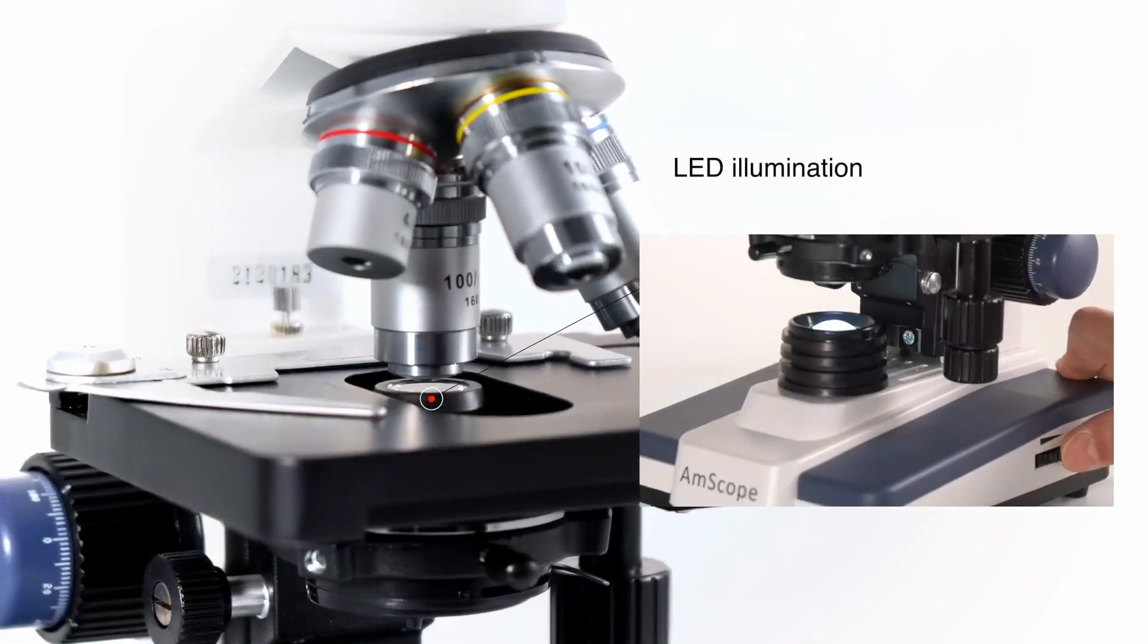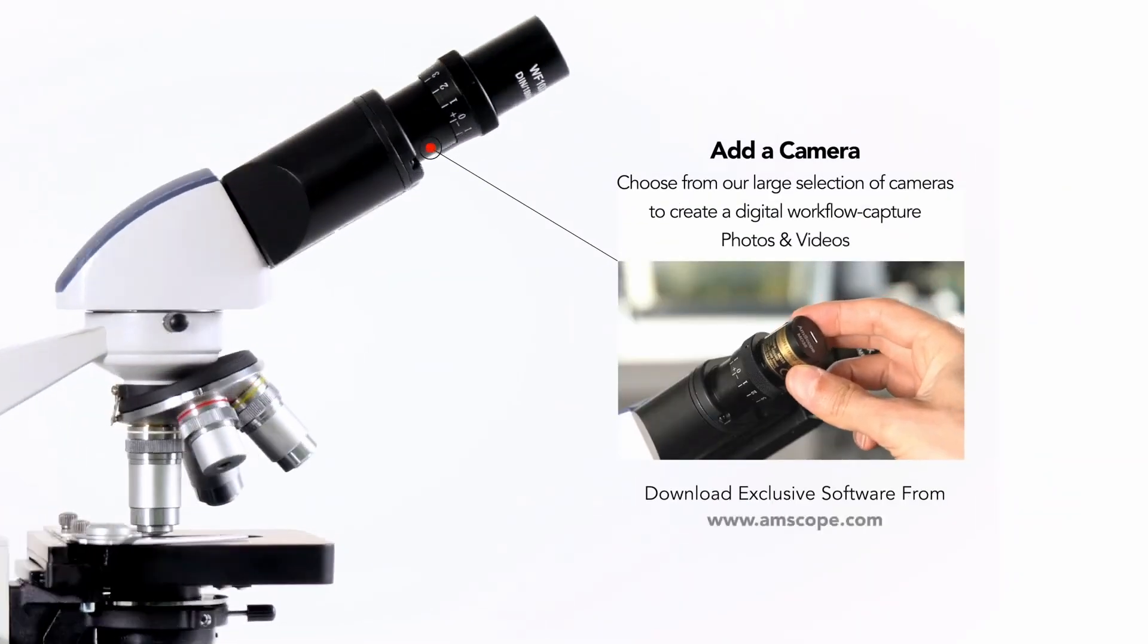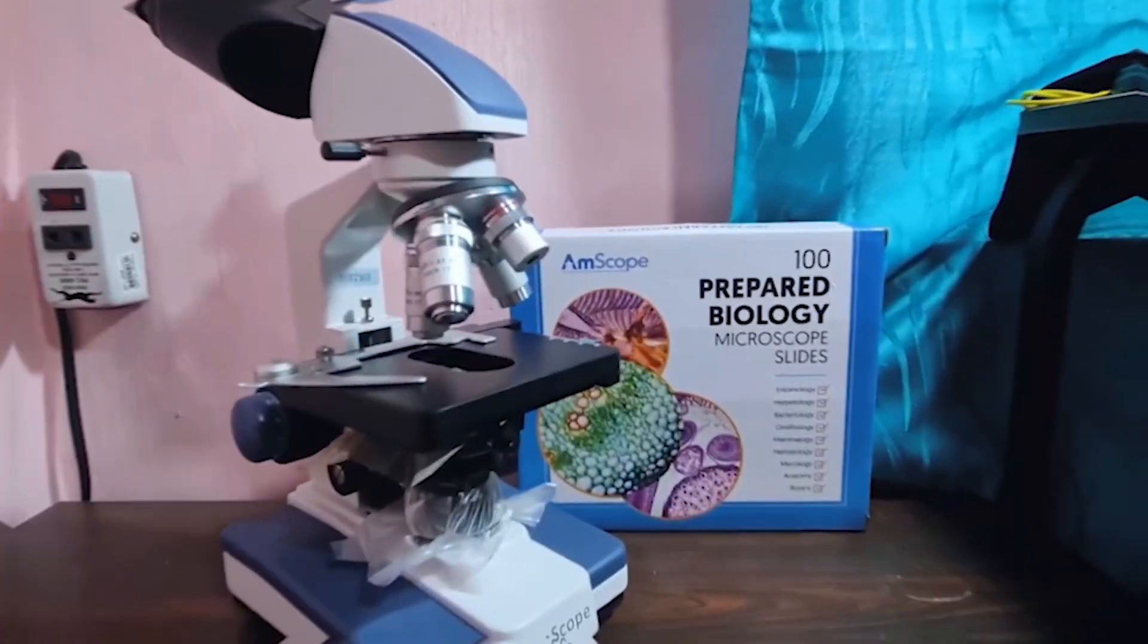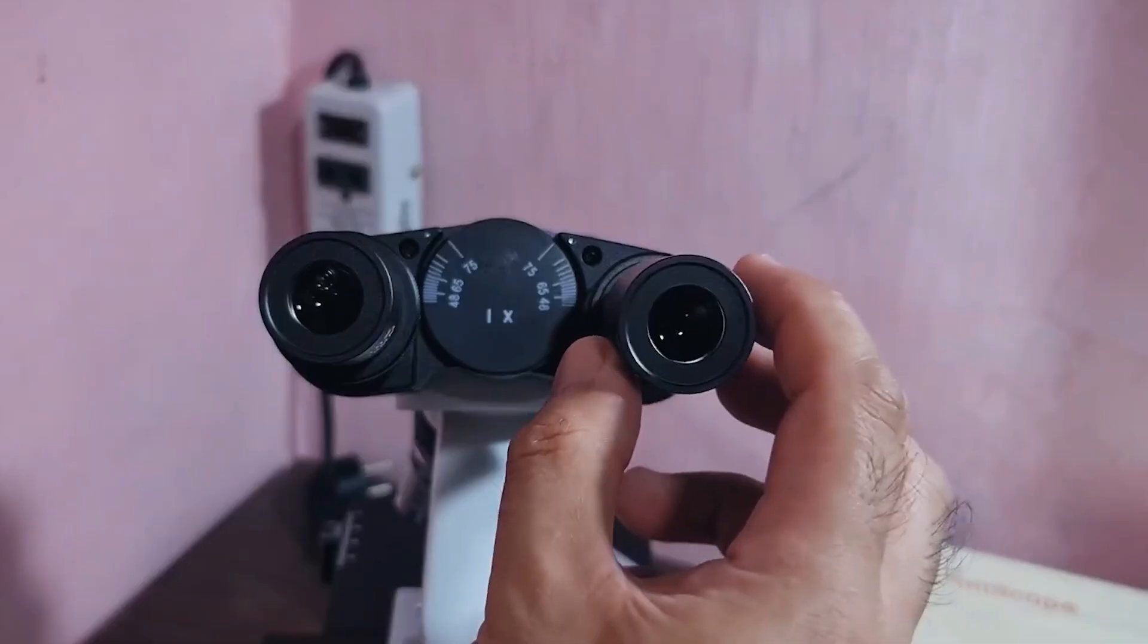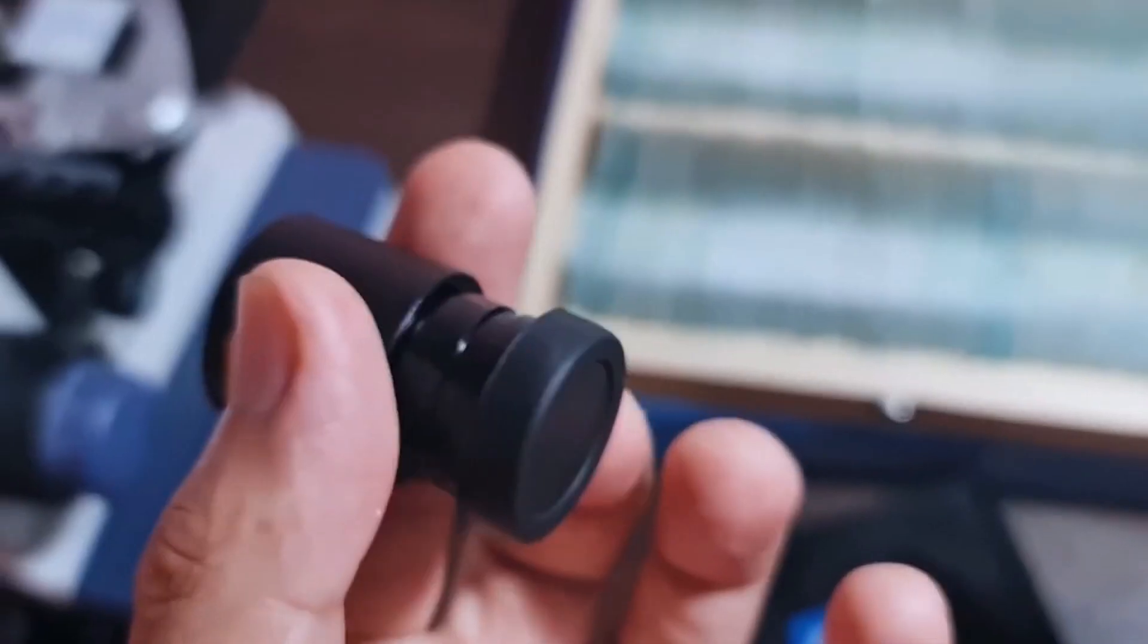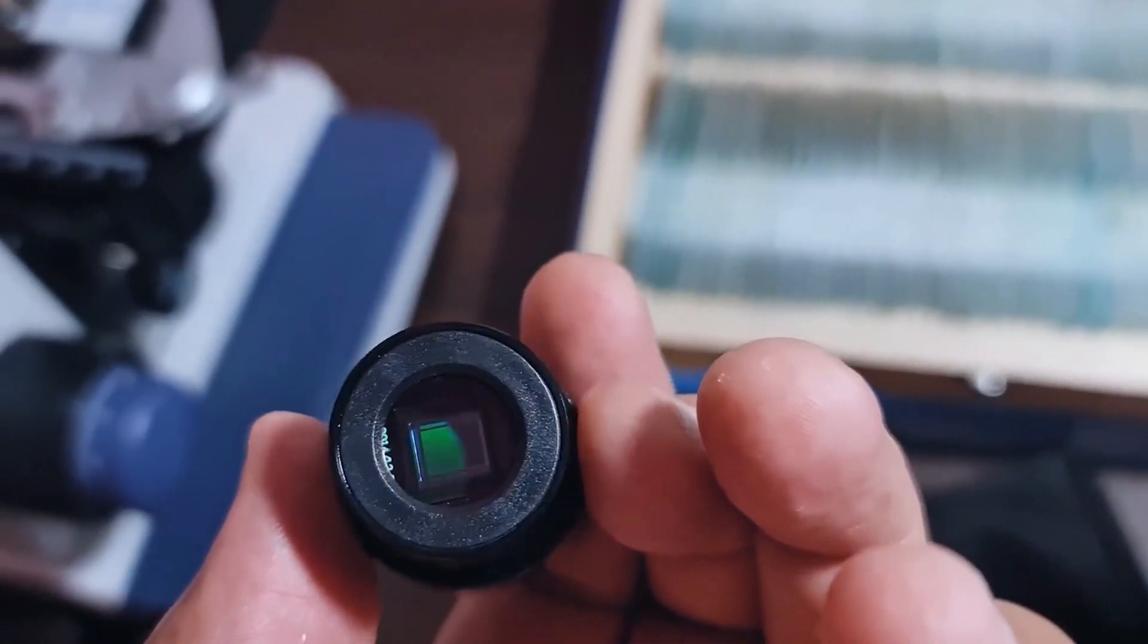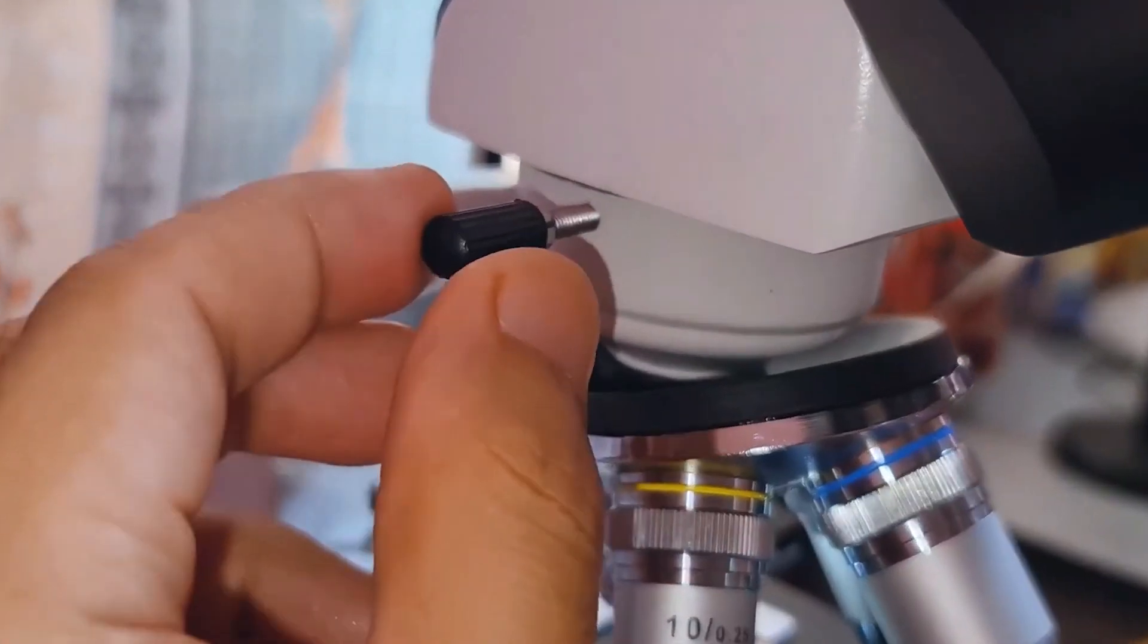One of the best aspects of this design is the adjustable interpupillary distance, ranging from 53 to 77mm. This means you can customize the fit to suit your eyes, ensuring comfort during those long sessions of exploration. Plus, the fixed 30 degree vertical inclination of the eyepieces significantly reduces eye and neck strain, allowing you to focus more on your samples and less on discomfort. The 360 degree rotation capability of the head adds to the convenience, enabling you to share your findings with others easily while providing a comprehensive view.